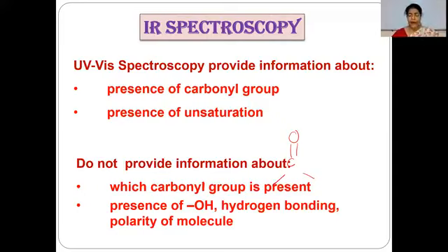It is silent about whether this carbonyl is acidic, aldehydic, ketonic, or any other group. So it only provides information about a broad range, that is the carbonyl group.